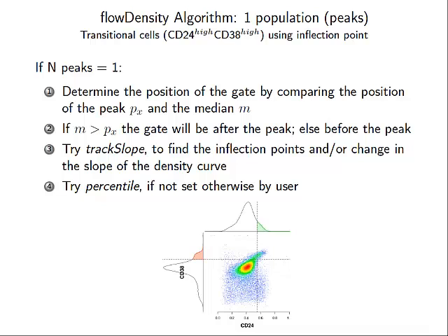Theoretically, if you added more markers to this data set, that might pull something out in some higher dimension. We actually talked to them about that, that they need to improve some of their gates a little bit.